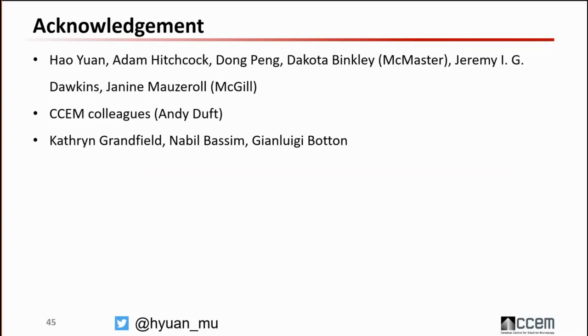Okay, on the same types of samples, again 2-4 samples, what is the ideal working potential to not induce defects or implant gallium in the samples? There are many tips you need to pay attention to. For example, people start with some electron deposition, without even any ion introduced at the very beginning of the sample preparation. Maybe something like a hundred nanometers of protection, which is at the limit. If we look back at the simulation, you want to be confident that even when you put your ion deposition after, the ion won't generate any defects or any implantation into your sample.